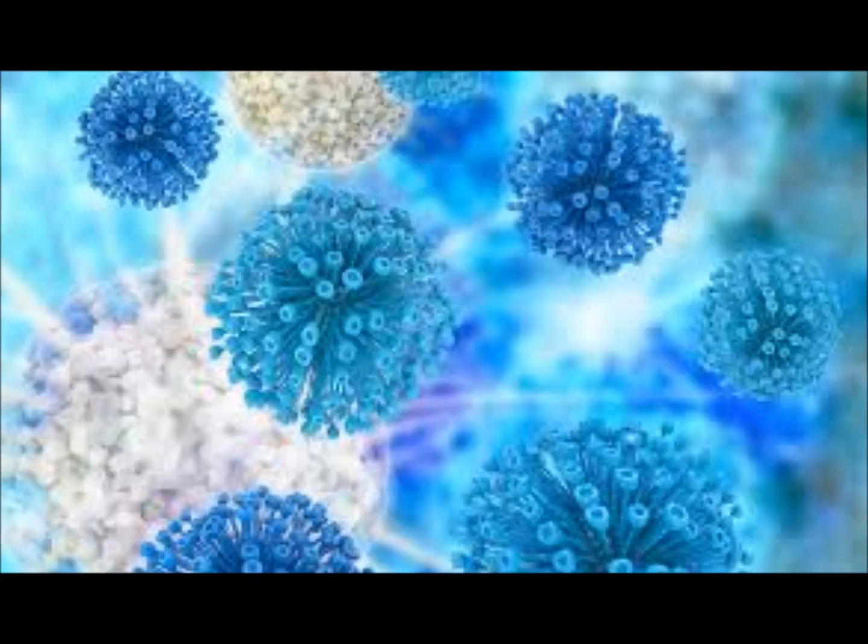A lot of micro is so ambiguous. You've got to remember, we're getting you to be entry level. We're not getting you to be experts coming out of here. We just want you to have the basics so they can build your skills when you're doing it every day for 8 hours. Okay? So on a preliminary smear, blood cultures is the only one. Those are easy. All you say is gram-positive cocci. You don't even have to enumerate. You don't have to do anything but say that's what's present.